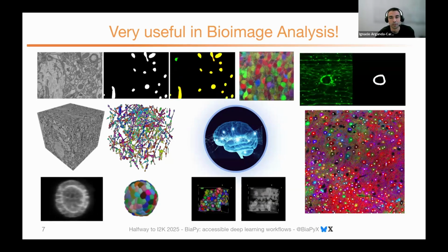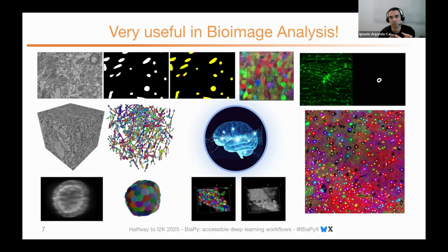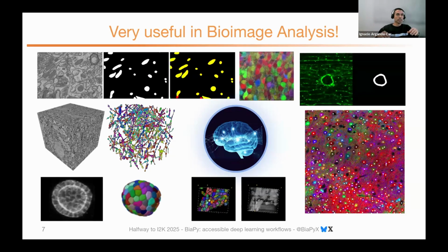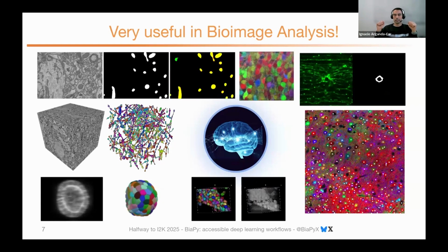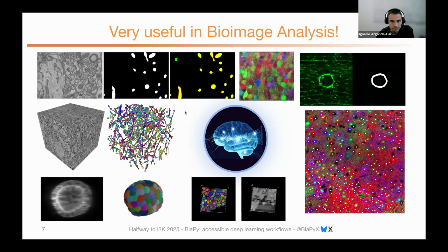As you probably know by now, we can do many different things: detect cells, their positions, their locations, or different types of organelles in many different image modalities, follow them in time, or detect specific objects of interest at the scale of a full organ, etc.